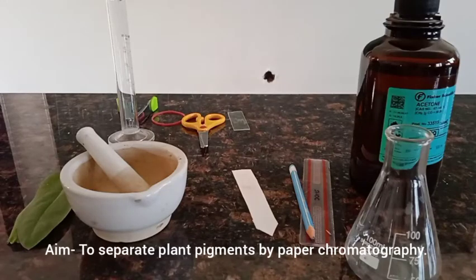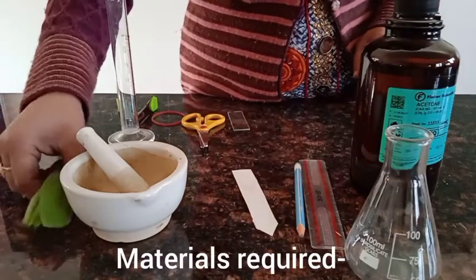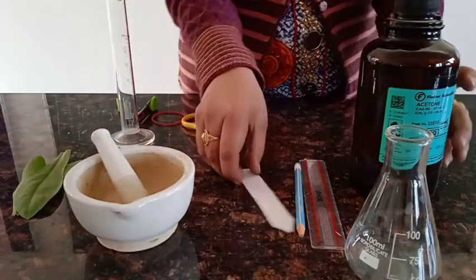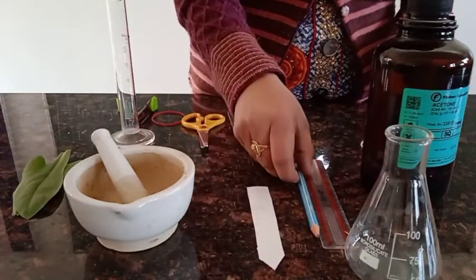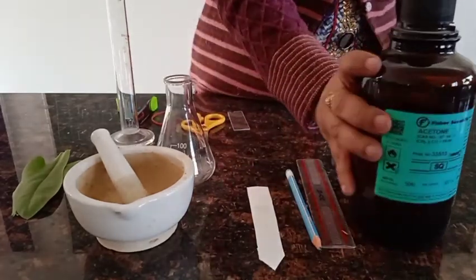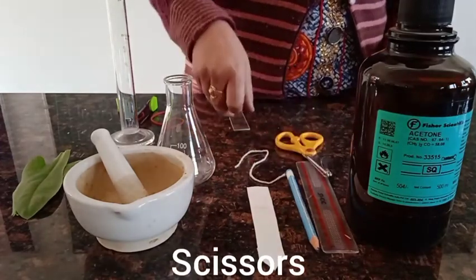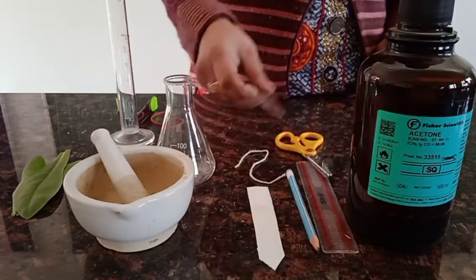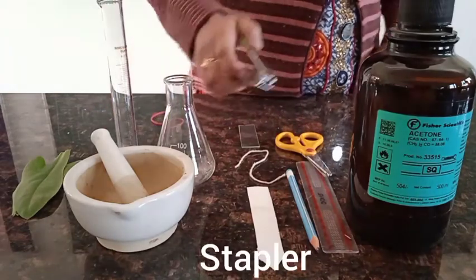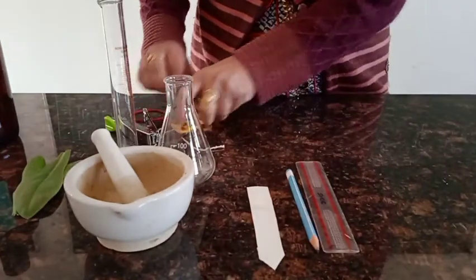The aim of this experiment is to separate plant pigments by paper chromatography. Materials required: freshly plucked leaves, pestle and mortar, chromatographic paper, pencil, scale, conical flask, acetone, petroleum ether, thread, scissors, slide, measuring cylinder, and a stapler.